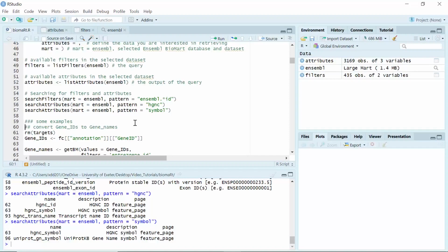If you watched my Rsubread video tutorials, we used the Rsubread package to align the original sequencing data. But the Rsubread package only gives you the gene ID. It doesn't give you the gene names. So we can annotate the gene IDs and get the gene names.